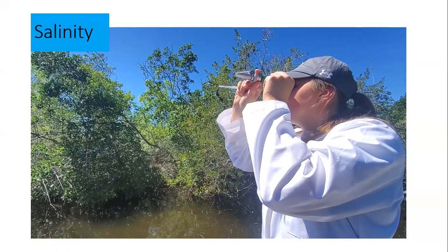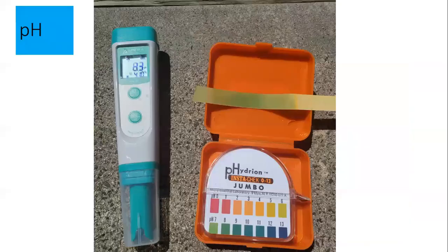Now, how she's going to read it is in parts per thousand. So this is looking at how much salt's in the water using a kind of 1,000 ratio. So if you have a salinity of 5, which would be pretty much fresh water, you would have 5 cups of salt in 1,000 cups of water. If you're looking at ocean salinity, which is more at 35 parts per thousand, that would be 35 cups of salt in 1,000 cups of water. The water in our estuary, or brackish water, is pretty much anywhere between like 10 to 27, 28 parts per thousand.